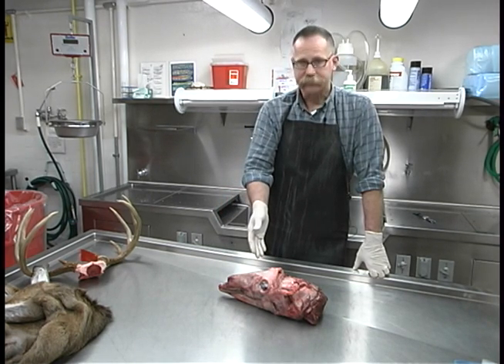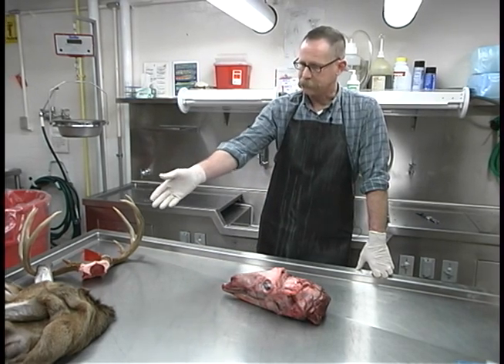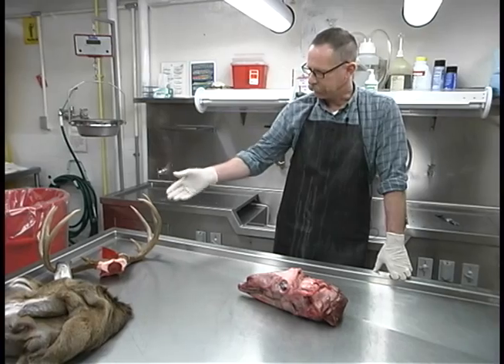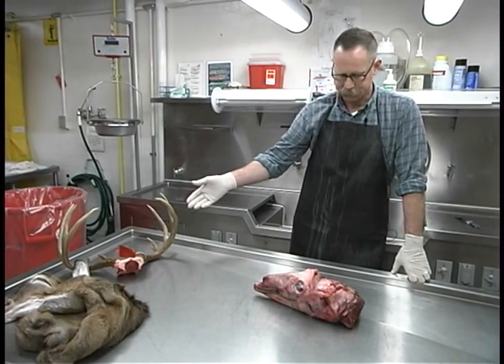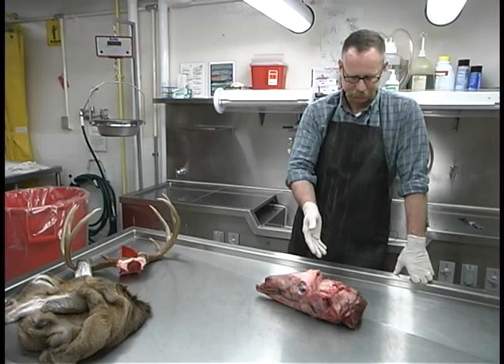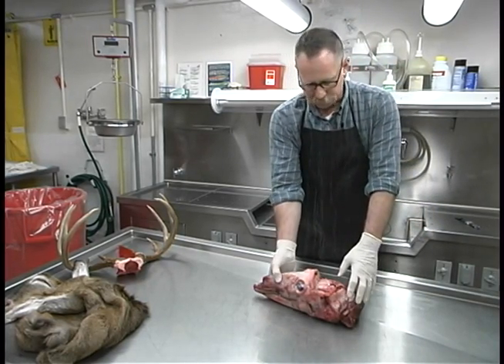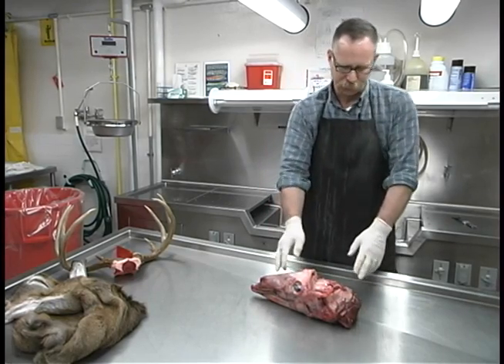As you can see, we have here a white-tailed deer head. It has been caped or skinned and we have removed the skull plate and antlers, and we're left with the skinned head and partial neck of the deer. This is an excellent time to remove the retrofringial lymph nodes from the deer before this is discarded.